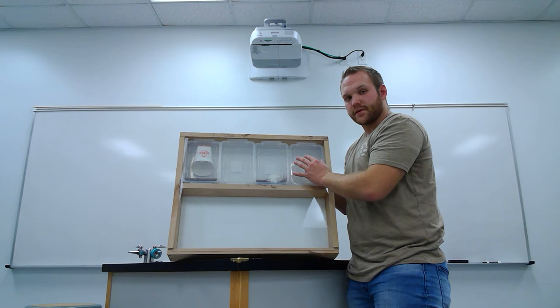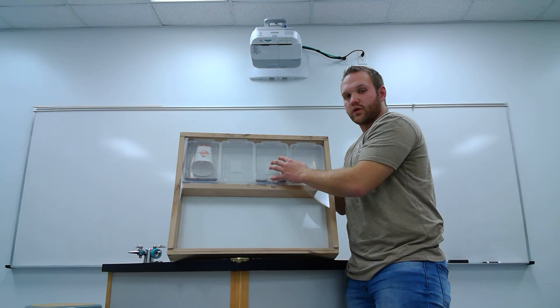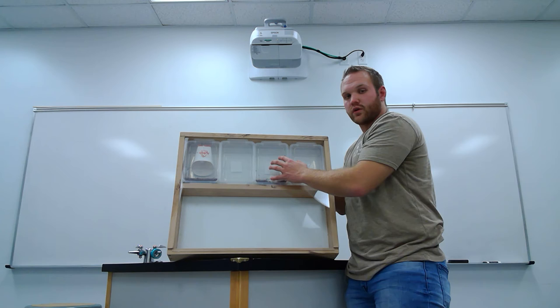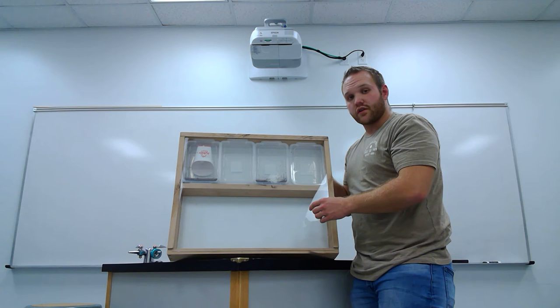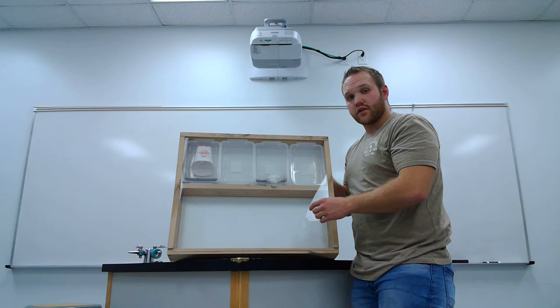And the nice thing about being able to have it down this way is that this area then becomes accessible without the bottom being exposed and you potentially losing some of your beetles. And I've made the background white so that you can easily observe the beetles through the plexiglass and the beetles will be very contrasted against the white background.